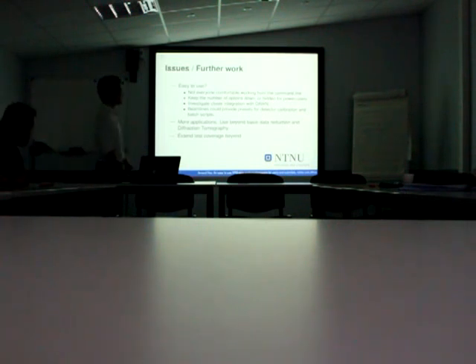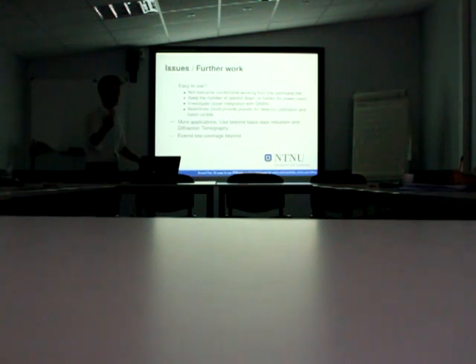Issues with this: not everyone is comfortable working from the command line, so it would be nice to have some graphical interface to the XRayLib functionality, just quickly to turn it on. I didn't have enough time to look more into it. And beamlines could provide some presets if they use just one detector or two detectors. They could have some pre-made scripts for just doing the calibration. So as much a finished solution as a framework to build upon.